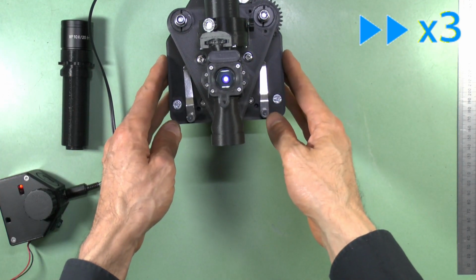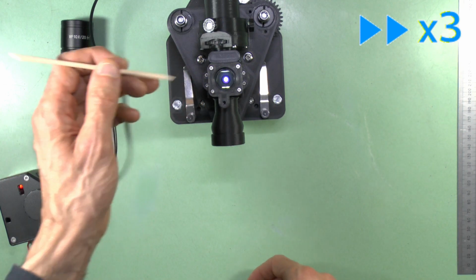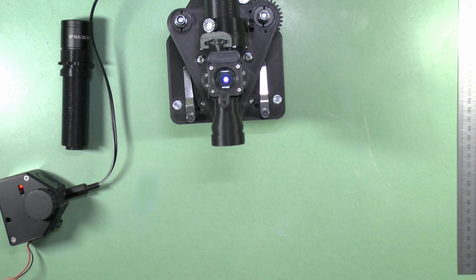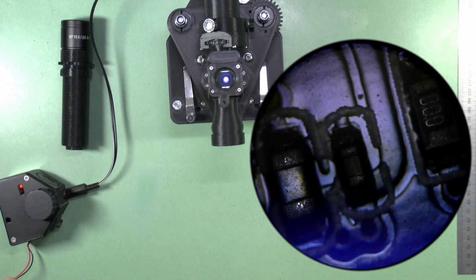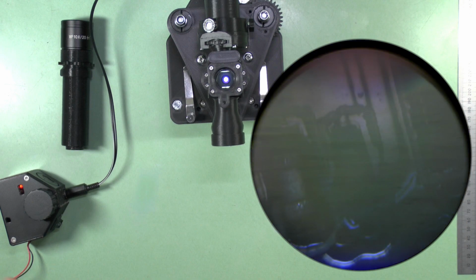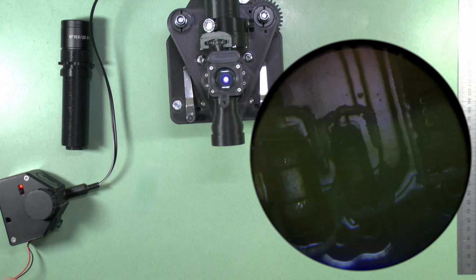The Epi-stop is designed to block these bright reflections of the incoming light, which reflect up the ocular tube from the free edges of the beam splitter. Left unchecked, these cause an annoying strong mist to cover the image when your eye moves even slightly to various off-axis angles when looking down the eyepiece.